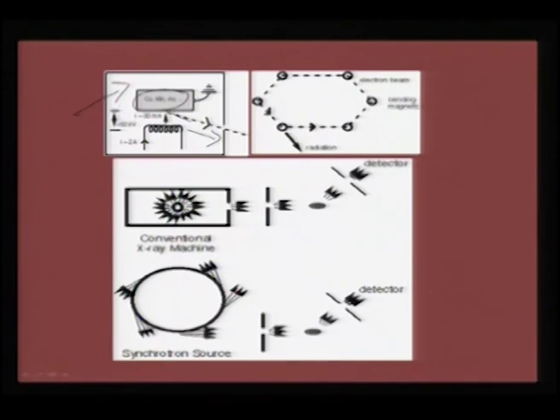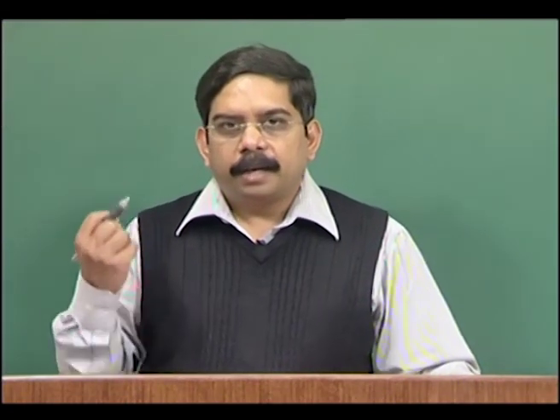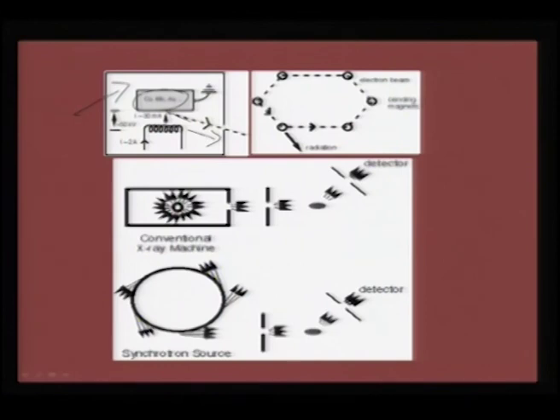What we do here is get the same X-ray, and the electrons are actually confined to a ring, and in this ring we try to boost the speed of the electron in such a way that it is an accelerated electron, which produces an X-ray beam that comes out and collides with your material to make very selective excitations. So, what we are trying to do is generate the same X-ray as that of the lab experiments, but we are trying to accelerate in a confined space. So, this is your conventional X-ray machine. X-ray comes, it interacts with your material and then it goes to the detector.